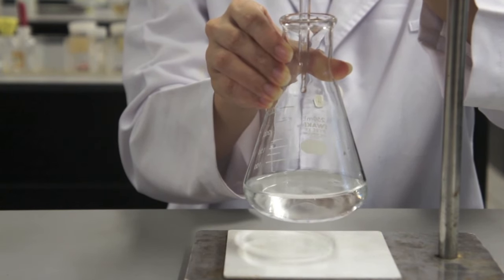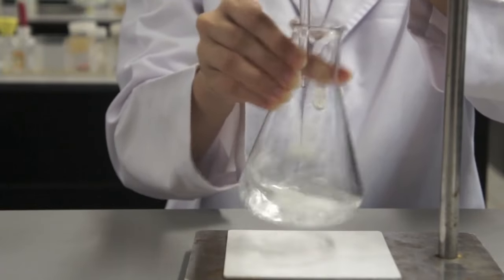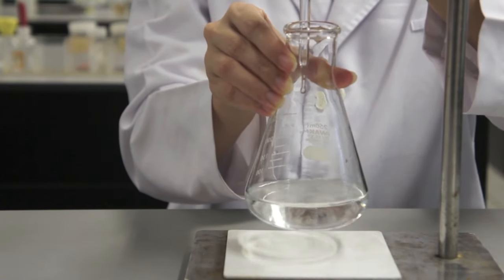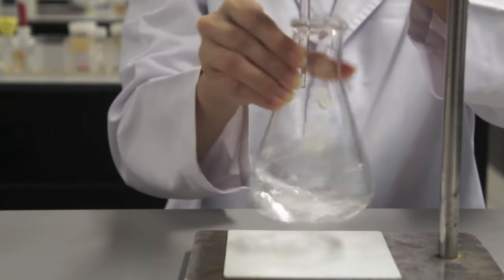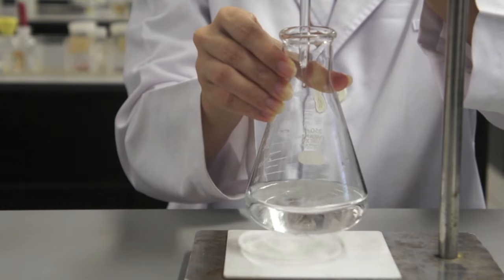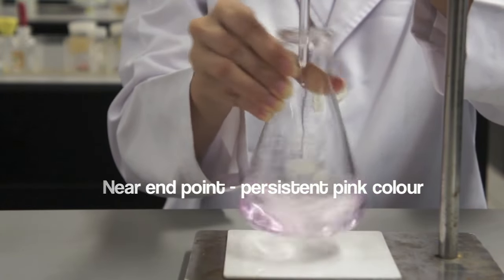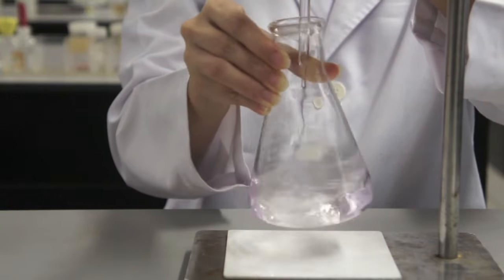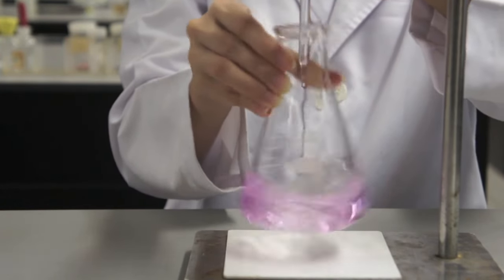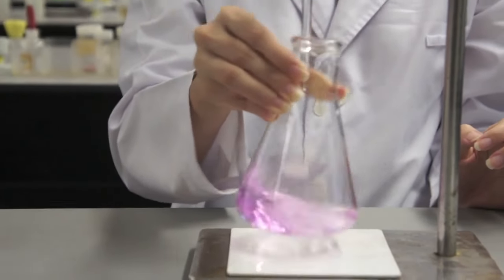Base is added in from the burette which turns the indicator pink. As you near the endpoint, the pink color becomes more and more persistent. You have reached the endpoint when one drop from the burette turns the solution pink permanently.